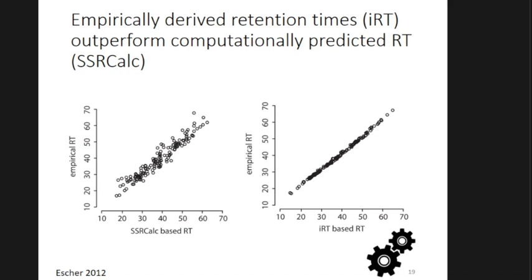There are some databases available now, if you're using databases to source hypotheses for which peptides you want to target, that are starting to include an IRT value. Remember, as long as the anchor peptides are the same, which they will be if you're using a commercial set of anchor peptides like the PRTCs one student mentioned, then for any other lab in the world using those anchor peptides, you can steal their IRT value for your peptide.